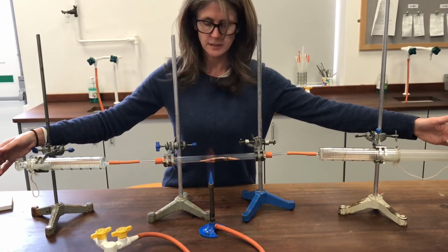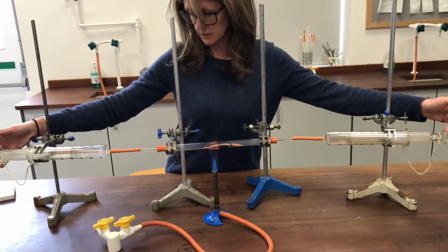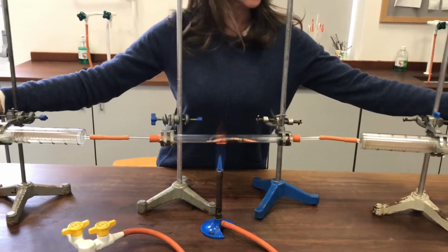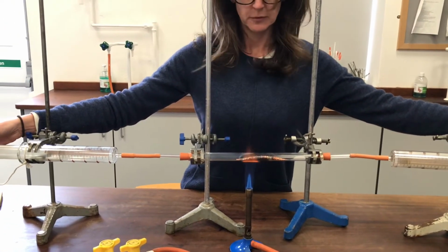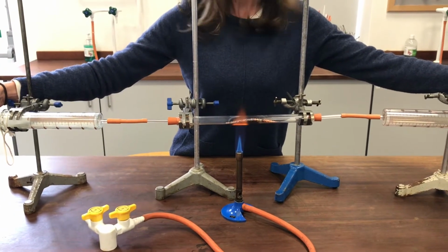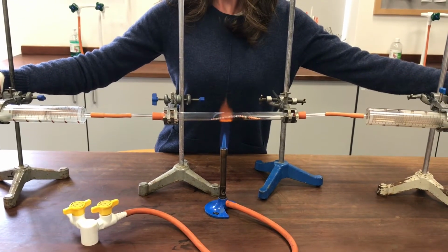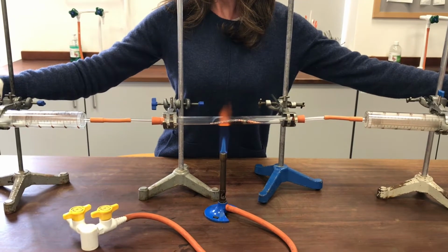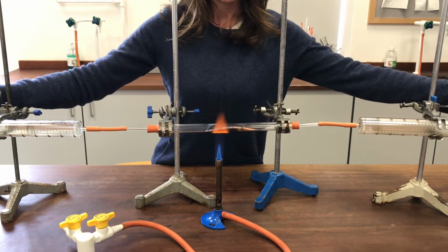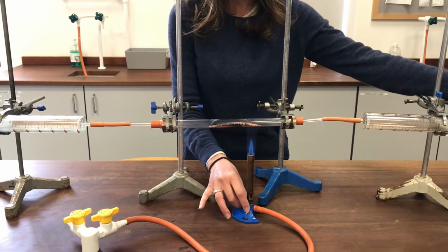I've already talked about this in some of your other science lessons, about how gases expand when they're hot. So at the moment, I'm not seeing any evidence that any oxygen has been used up at all. It doesn't look like the volume has changed at all. But of course, everything's so very hot at the moment, it may just be that the gas has expanded and that's why I can't see. So I need to wait until the end of the experiment when everything's cooled down to be able to get proper, accurate data from this. I'll move my Bunsen so that all the copper has a chance to react.